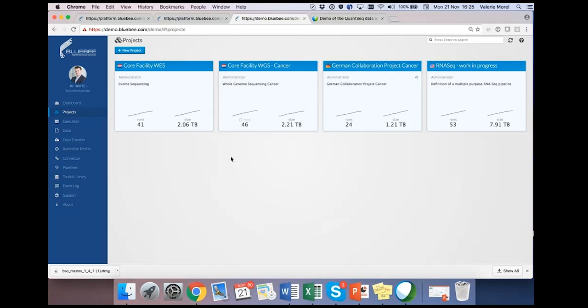So far, output will be the gene counts per sample, but we are also working on a differential expression analysis pipeline, and we will integrate that, so that you can specify your samples and then compute the differential expression on that.